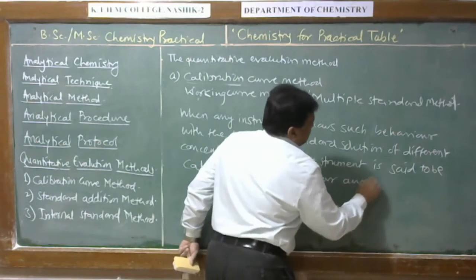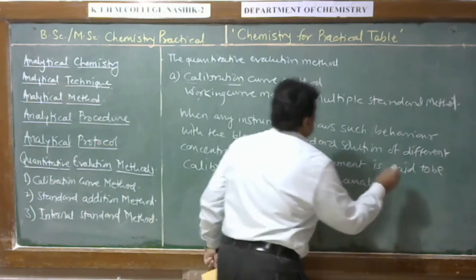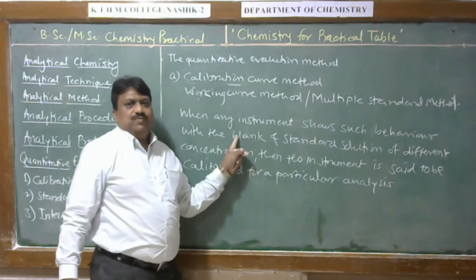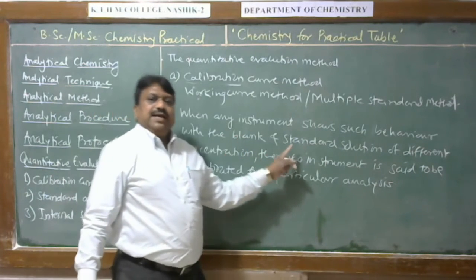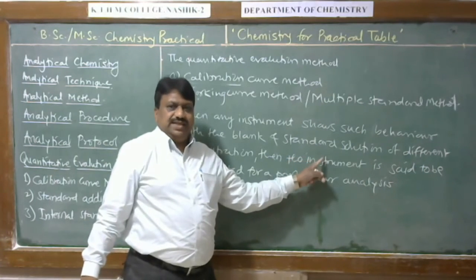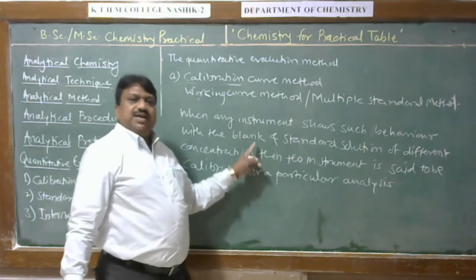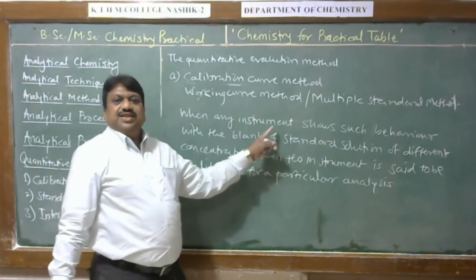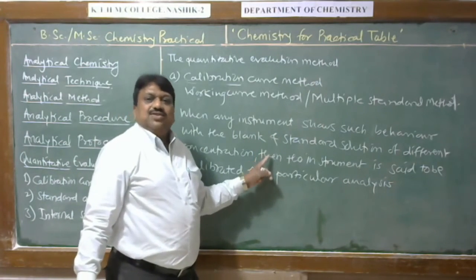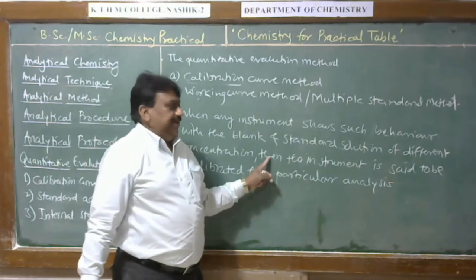That means for the blank solution the instrumental response is 0. It will increase linearly when the concentration of analyte in the solution increases linearly. When such a condition is satisfied by the instrument, then we can say that the instrument is said to be calibrated.